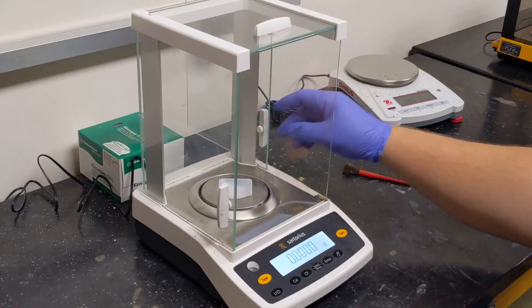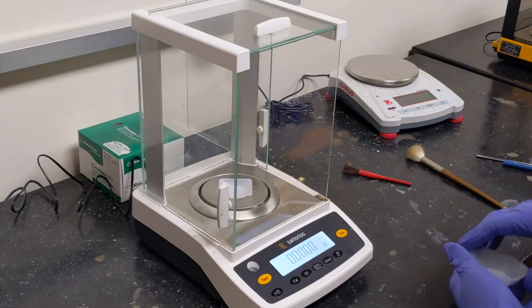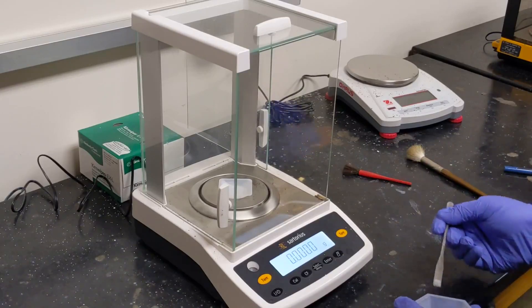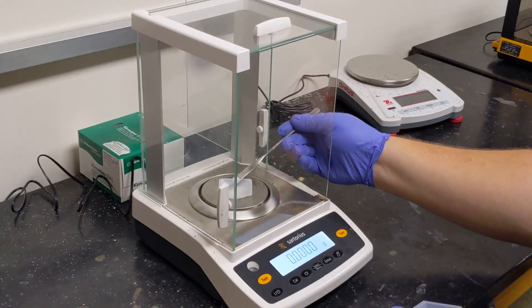Now we can open the door again, and we can begin to add our material to the weighboat. You'll have it in a separate container, and take your spatula and select some out on the spatula, and add it to the weighboat.